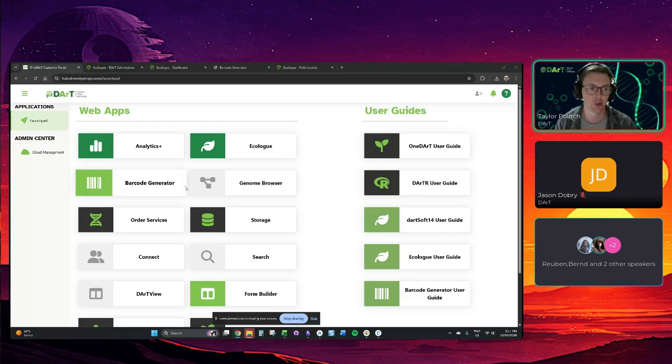It's essentially two applications that are integrated. We've got the mobile app for data collection in the field, and we've also got the web app. The web app's for configuring projects, customizing data collection forms, organizing samples to send them to DART. And we can also create dartR metadata files with them. So the web app is where I'll start the demo.